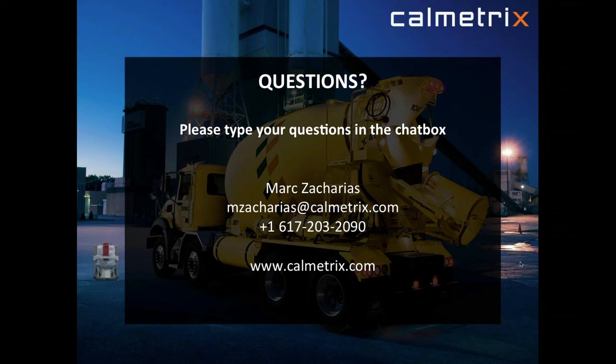The person that signed up as user says, I conducted a rheometer test on cement blended with an agricultural waste ash. What I found was that the mix became stiff. If I have two mixes with different water content but with the same flow, can these mixes be used as samples to study the rheology effect of dispersant admixture? Absolutely, that would be a prime example of what you would want to do with this. You want to look at the effect of the admixture, how it works on one and the other mix, when they have the same flow. You could absolutely put this in the rheometer, and you would get very quick and visual conclusions of which of these admixtures works best for your purpose. It would work very well.